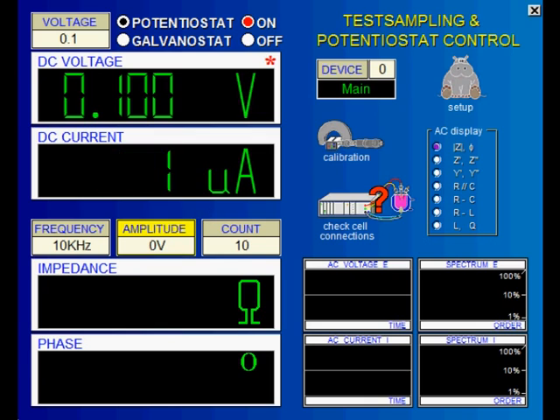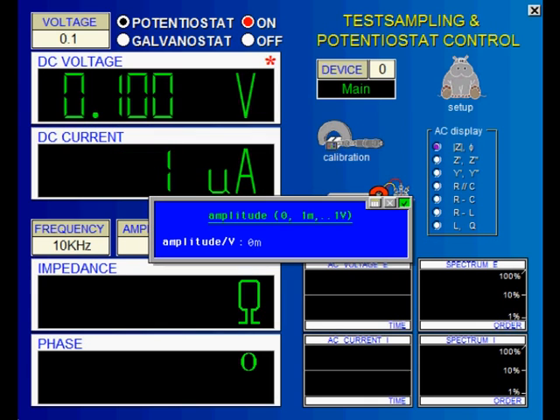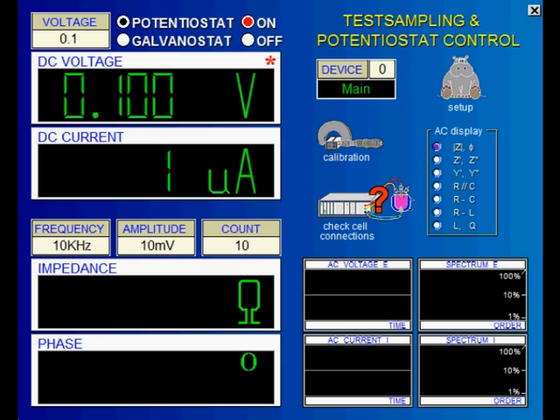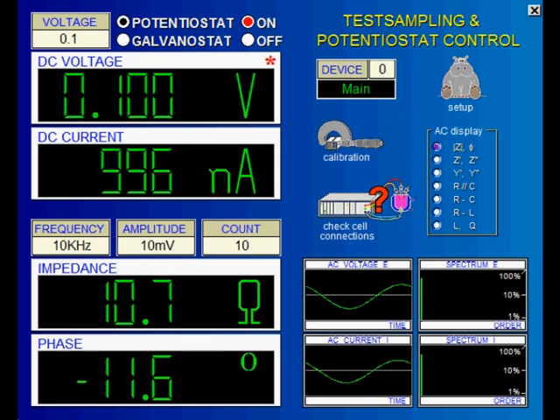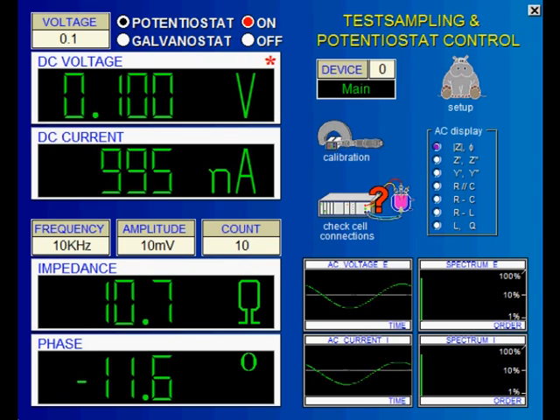You set the AC amplitude here. After you confirm this value, the AC amplitude is automatically switched on. It can be set in 10 steps between 1 mV and 1 V. An input of 0 V switches the AC amplitude off.